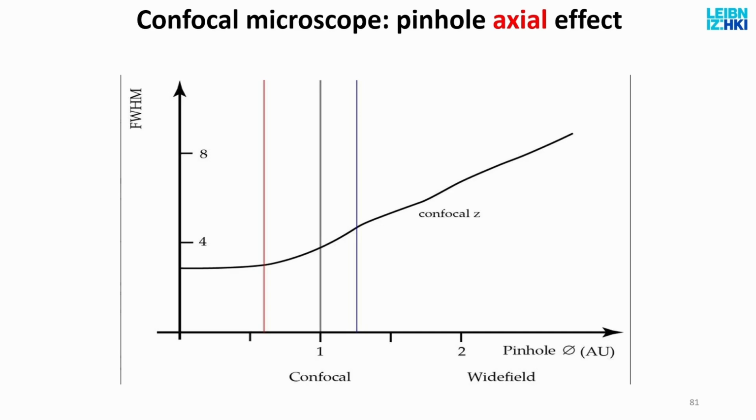So what I did was I calculated what the image would look like had the confocal pinhole been close to zero. And this gives you, like I said, approximately 1.7 times better resolution, and it also can increase the scan speed. So you will switch to this setting if you need to improve your resolution or you need to scan faster.